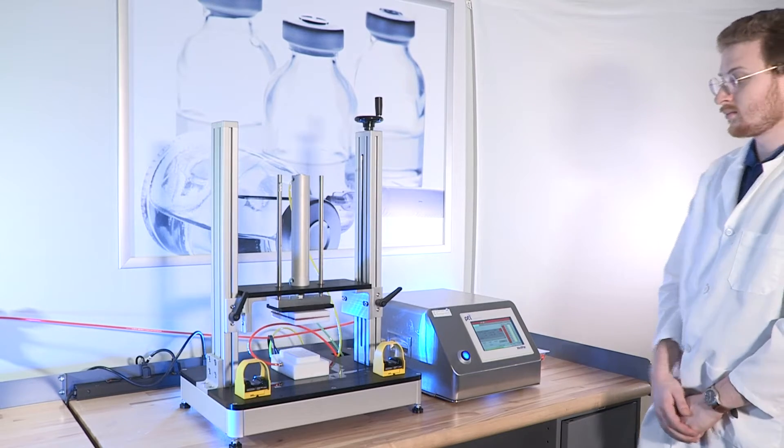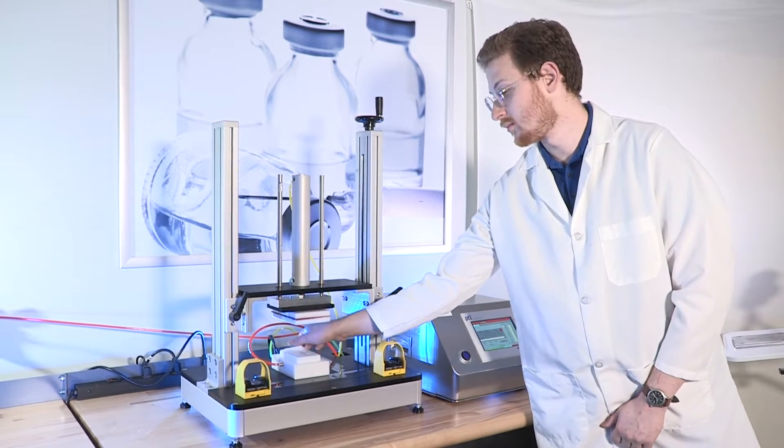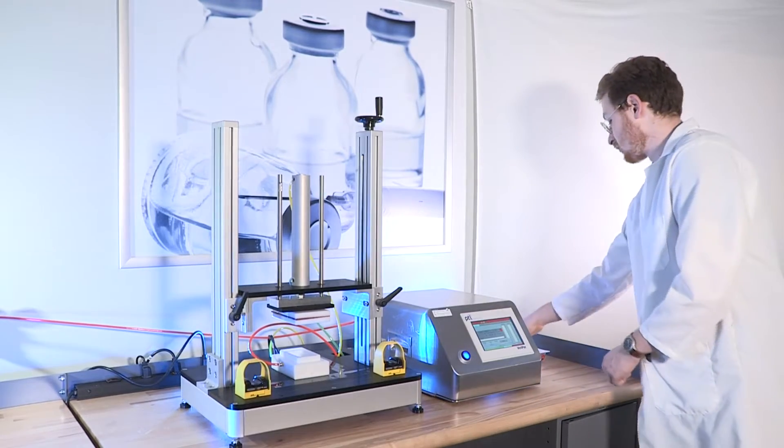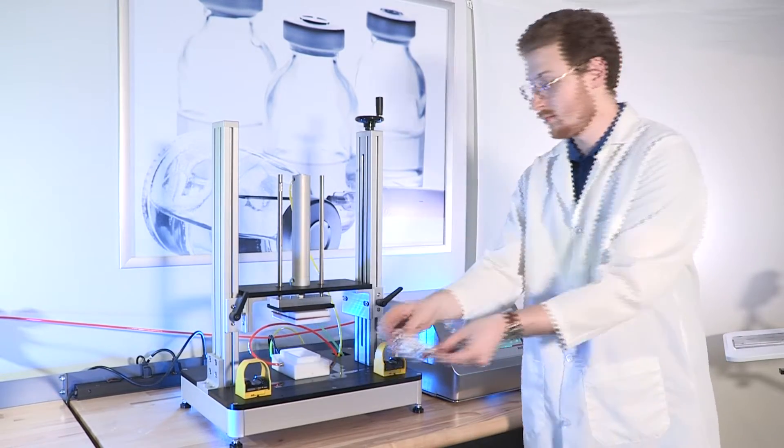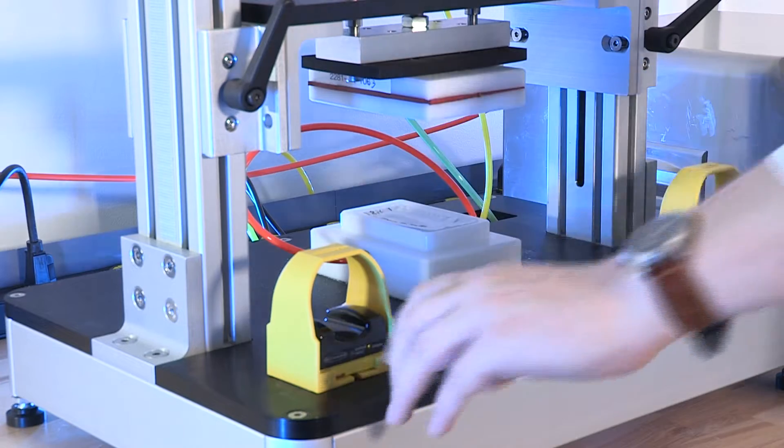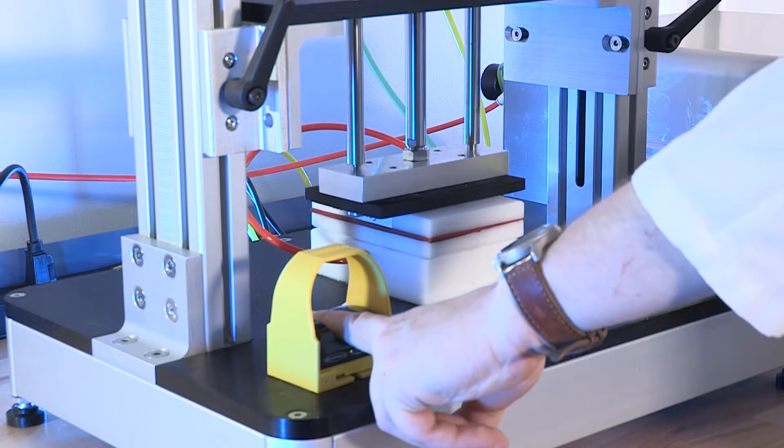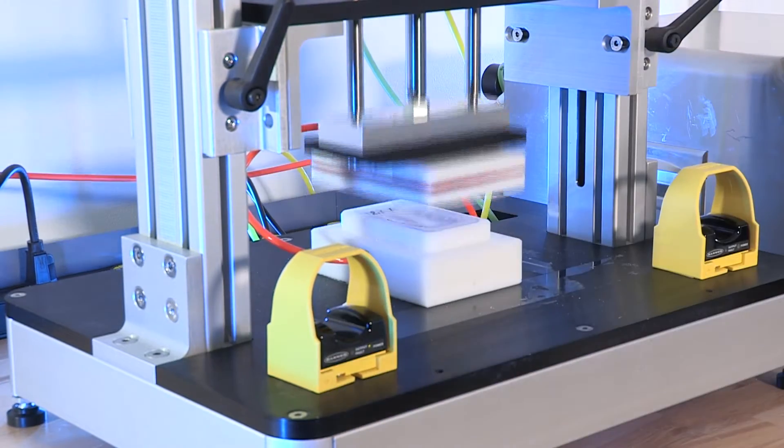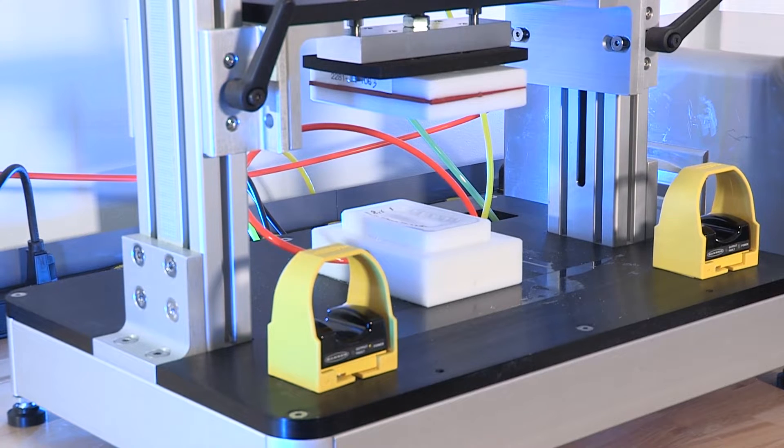The VariPak series of machines utilizes the ASTM F2338 Vacuum Decay Standard for its test method. That same ASTM standard was also originally developed utilizing PTI equipment.